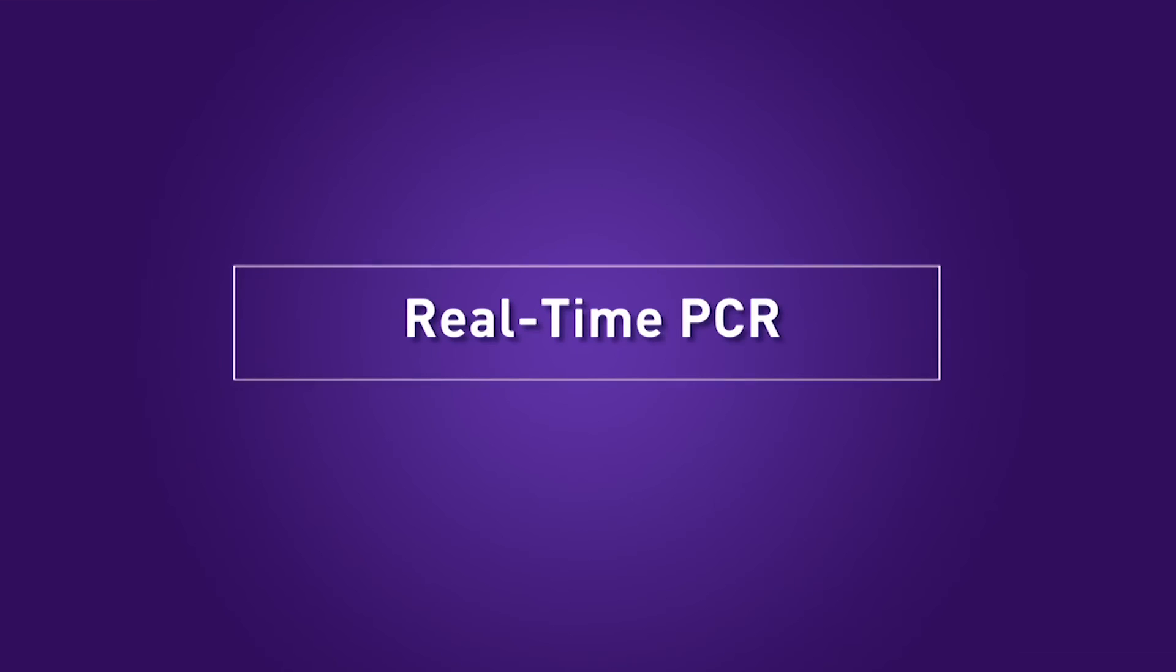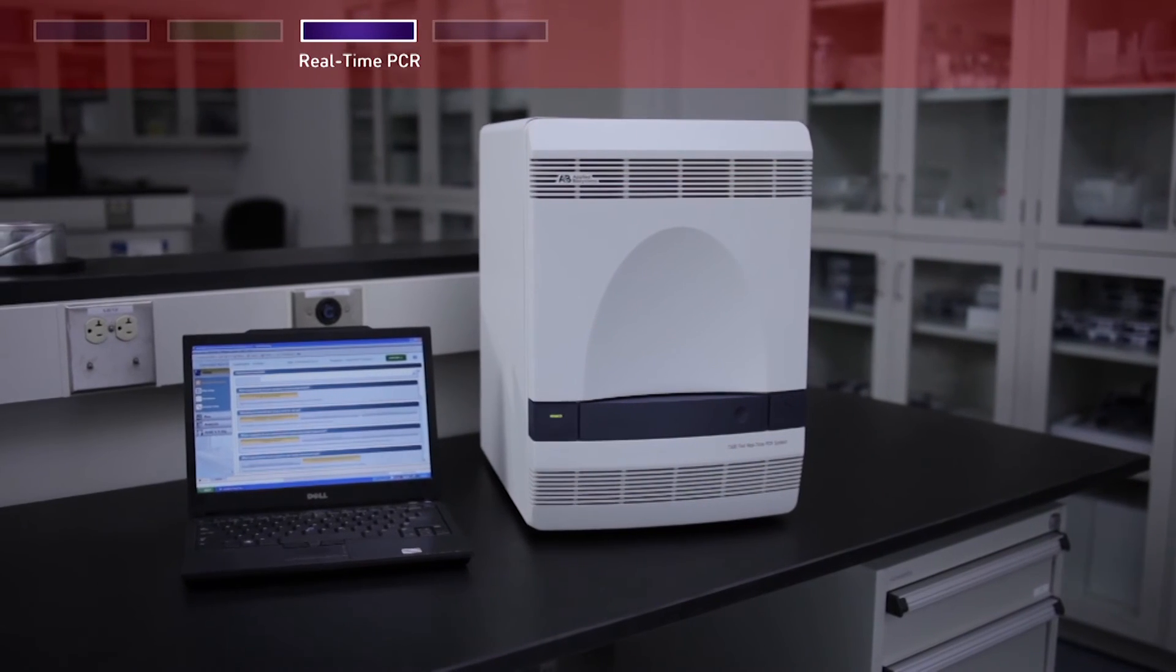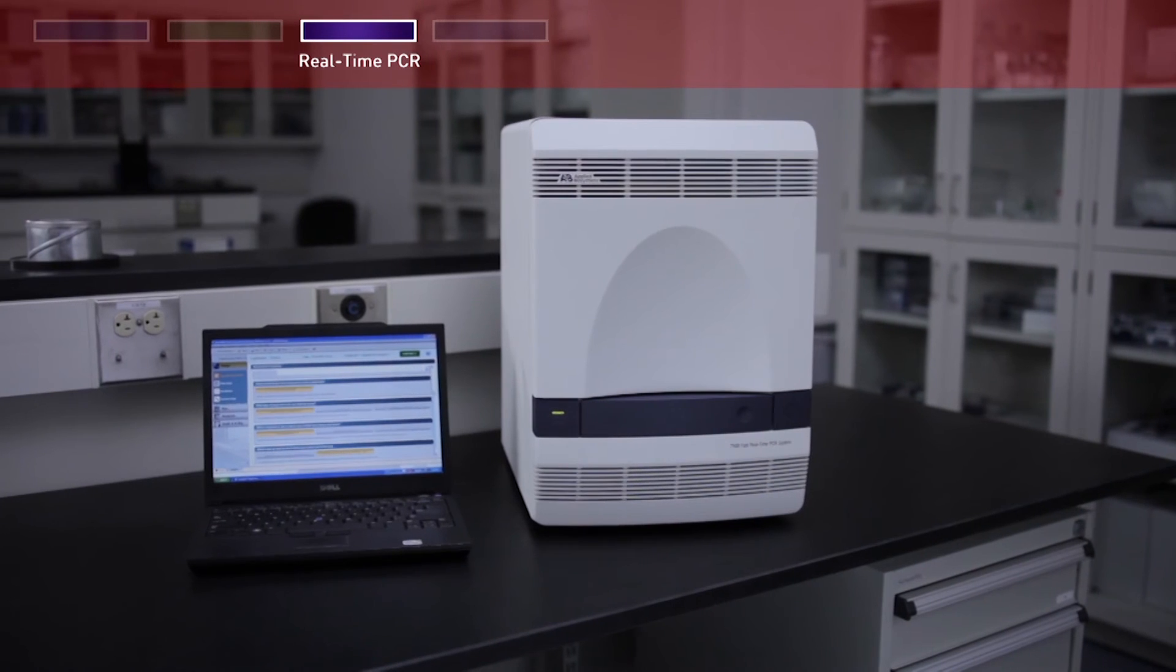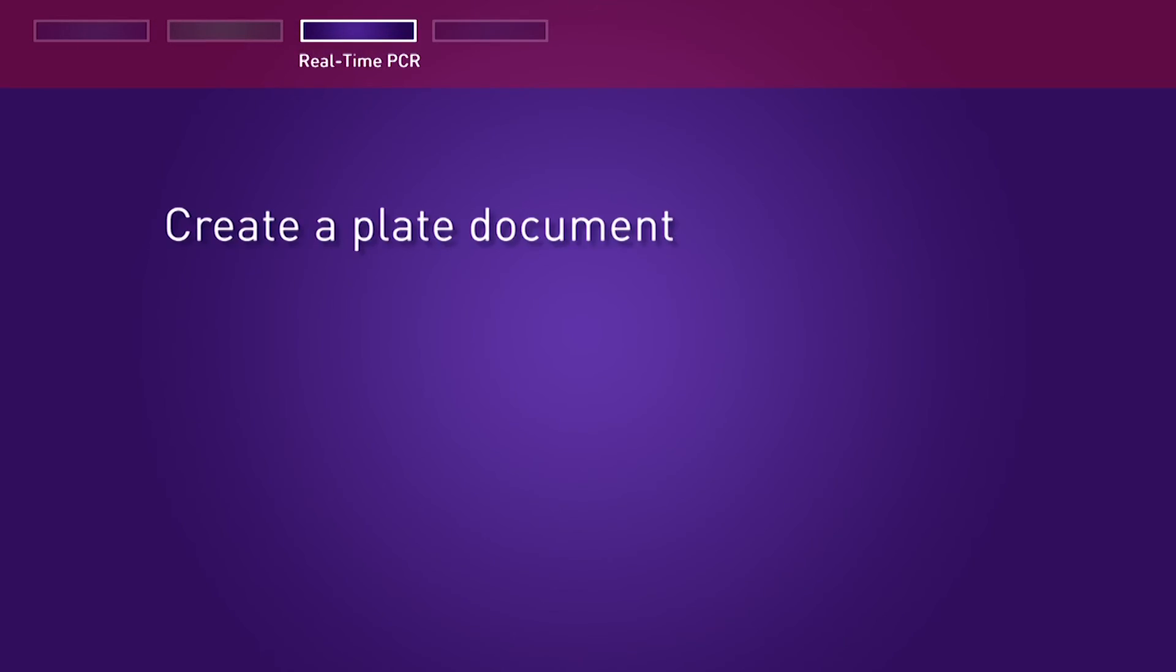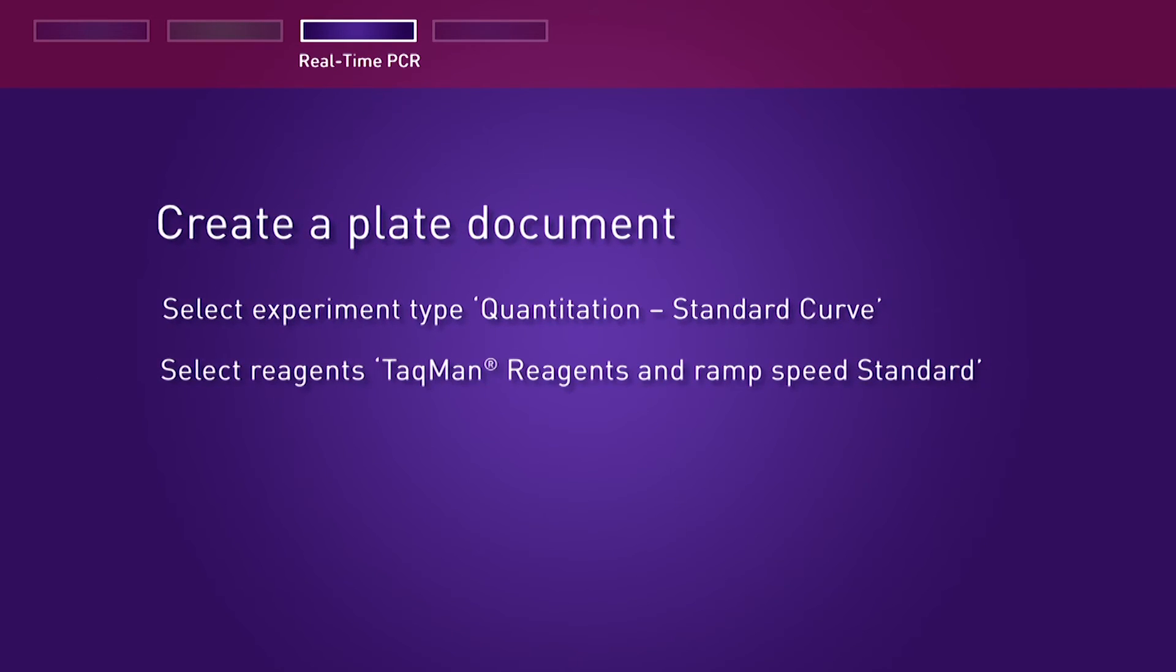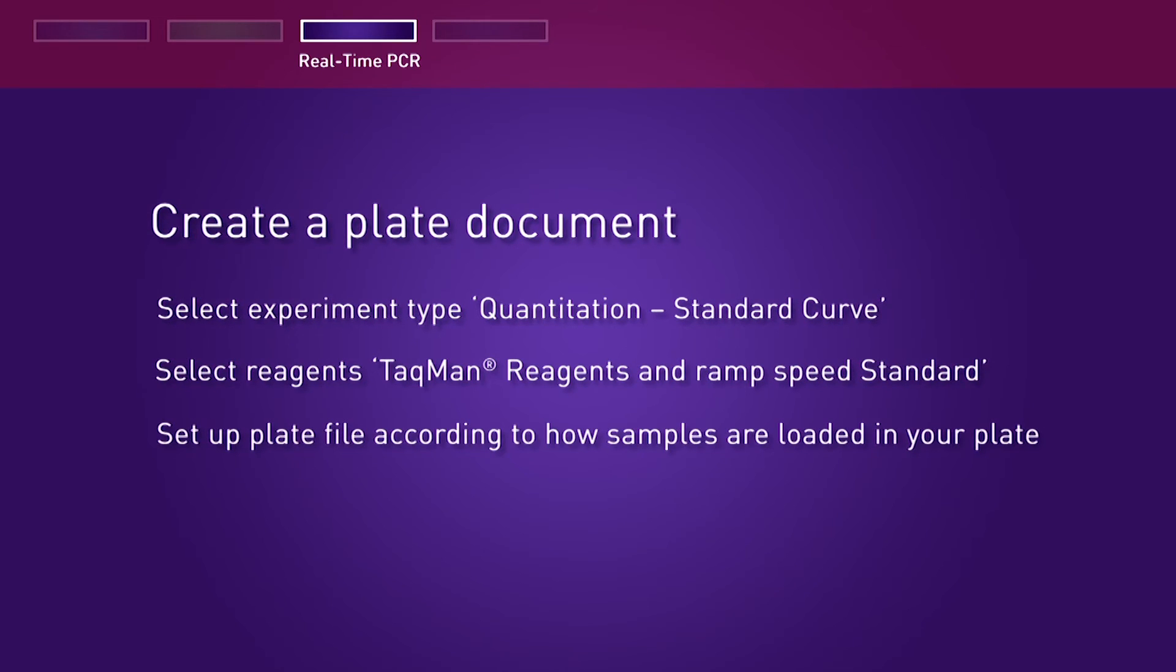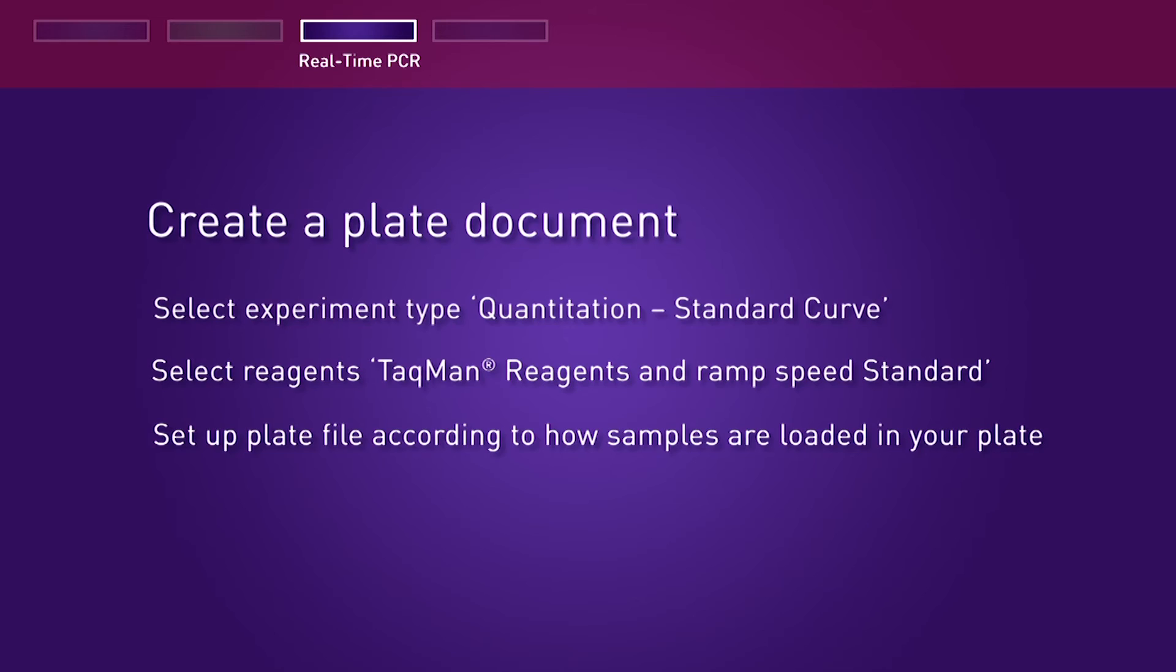Real-time PCR is performed in the Applied Biosystems 7500 Fast real-time PCR system. To begin the run, select Experiment Type: Quantitation Standard Curve, select Reagents: TaqMan Reagents, and Ramp Speed: Standard. Set up plate file according to how samples are loaded in your plate.